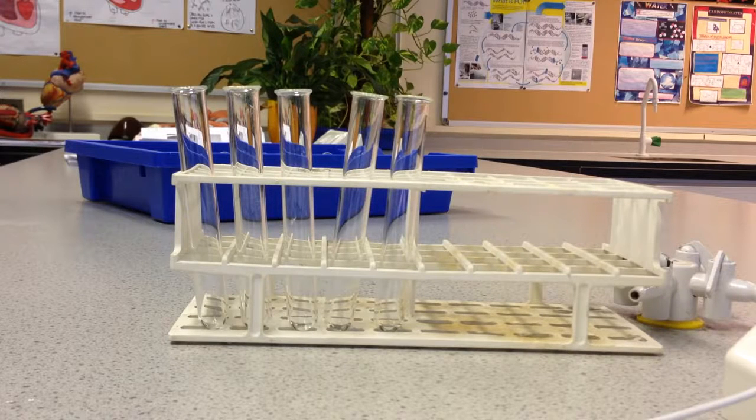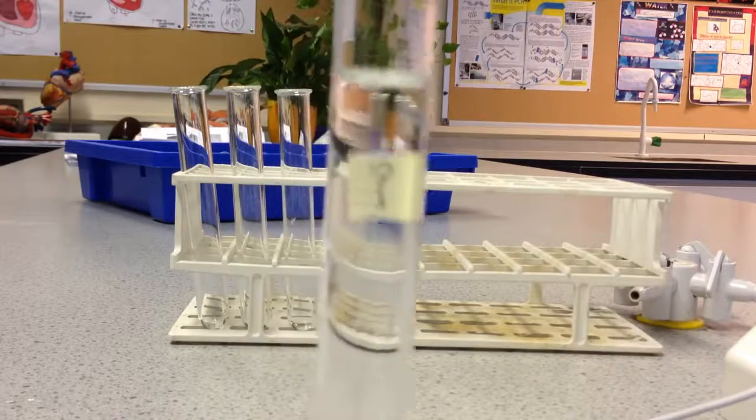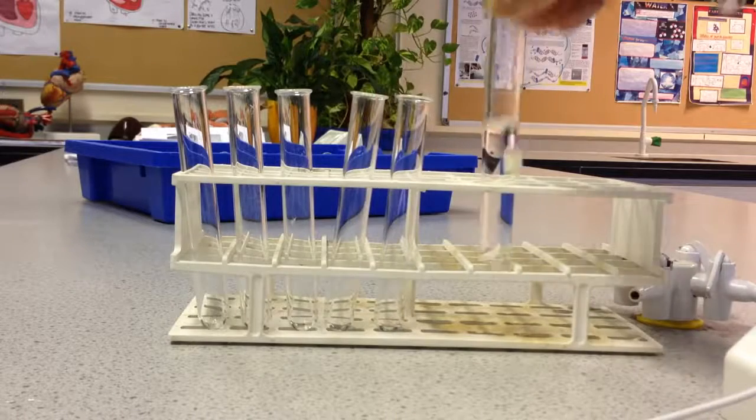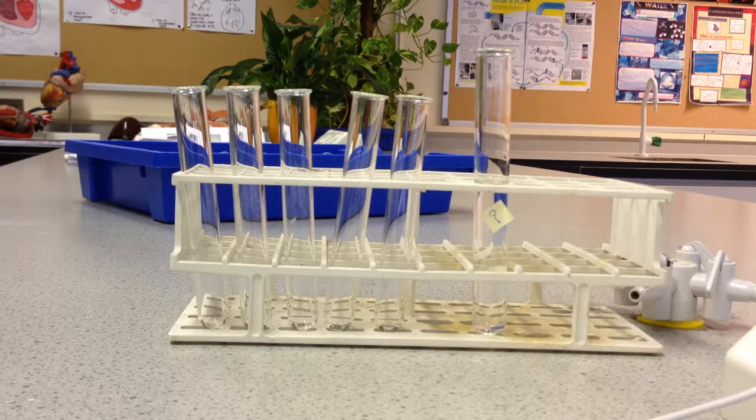So how do we go about it? So here we have the unknown solution, as you can see with the question mark right there. And I don't know the concentration of that solution. Okay, so how do I go about determining the concentration? What I need is a series of solutions of known concentrations.